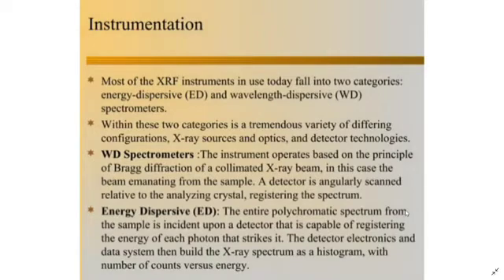Most of the XRF instruments in use today fall into two categories: energy dispersive (ED) and wavelength dispersive (WD) spectrometers. Within the two categories is a tremendous variety of differing configurations, X-ray sources, optics, and detector technologies.